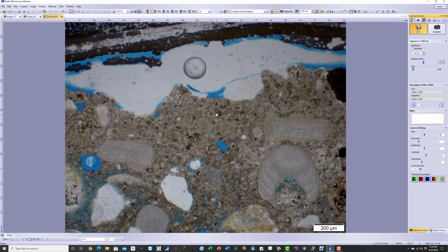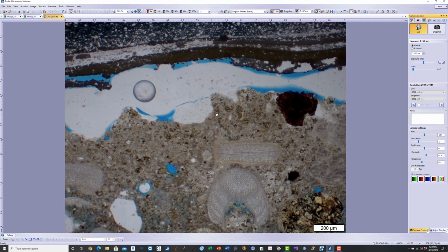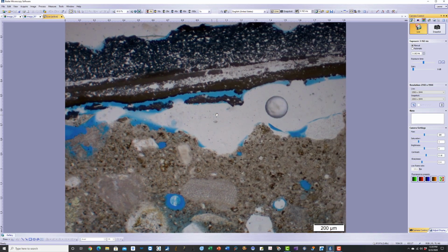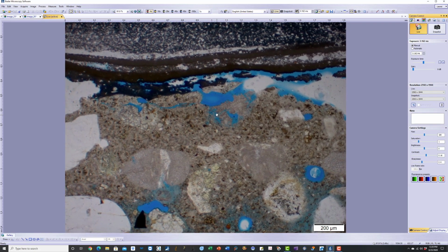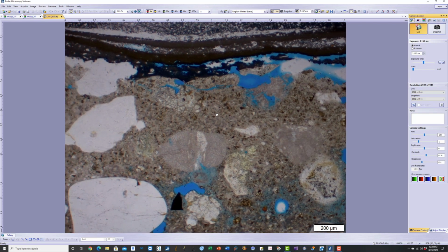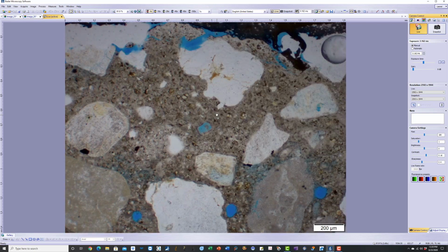affects the calcium silicate hydrate component, where the paste gets more and more porous by dissolution, decomposition of the calcium silicate hydrate. But for carbonation of the calcium hydroxide component, paste usually densifies, as you can see here. And this densification is the beneficial aspect of the carbonation here, because it prevents migration of the carbon dioxide beyond this carbonated densified layer.